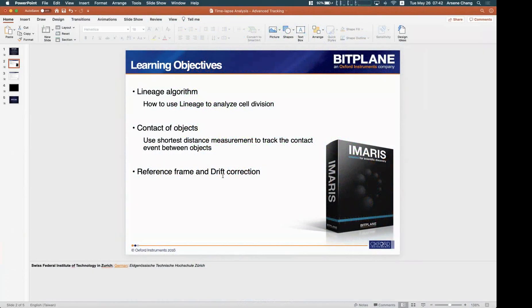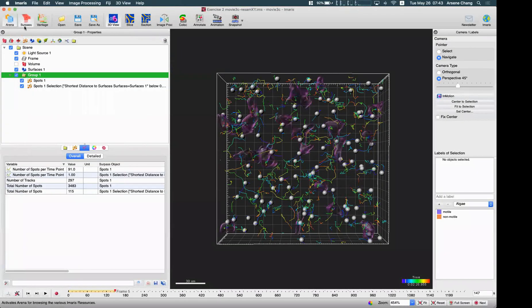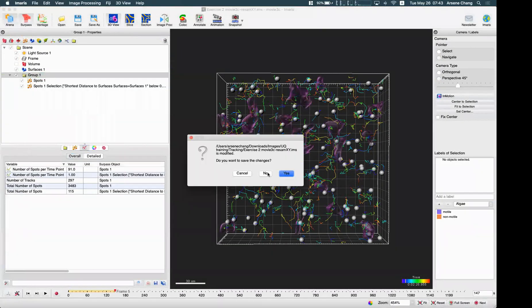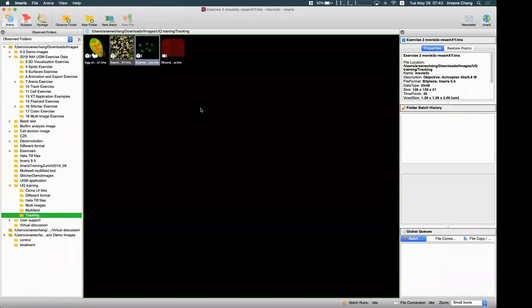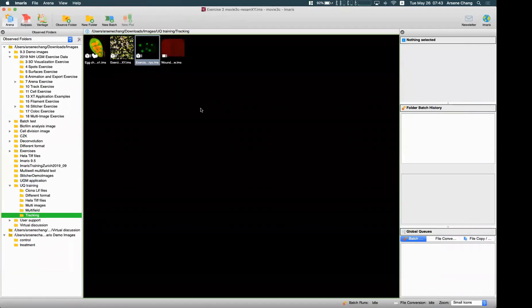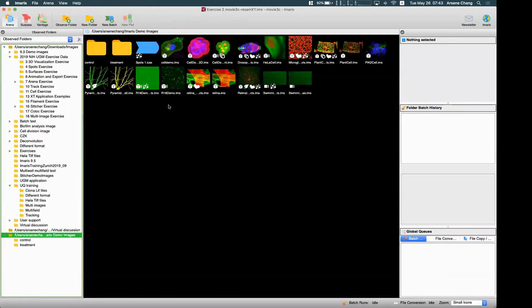The last topic is the reference frame and the drift correction. I will show you some examples of using the reference frame, how it can be used in tracking, and also how to do the drift correction. I will start from the drift correction — the easy way, a very simple example.